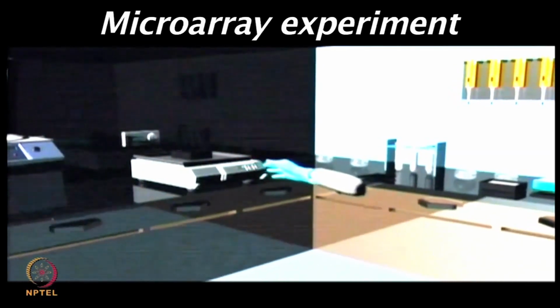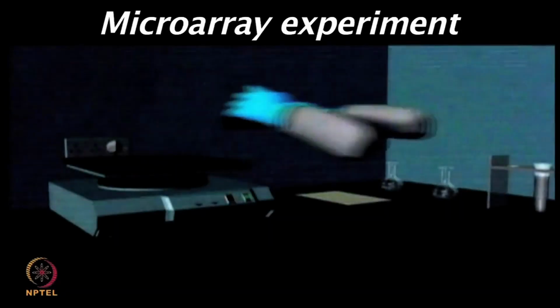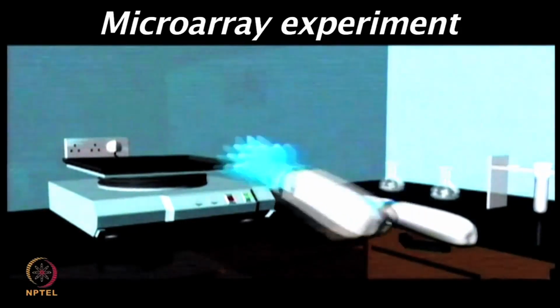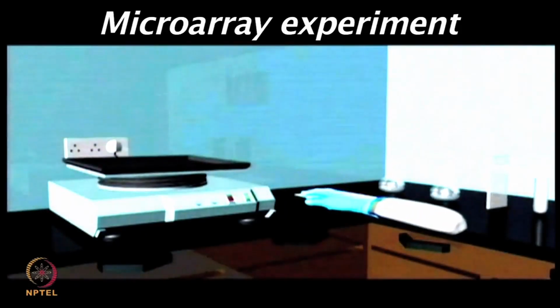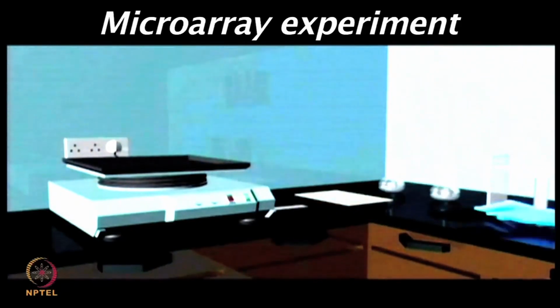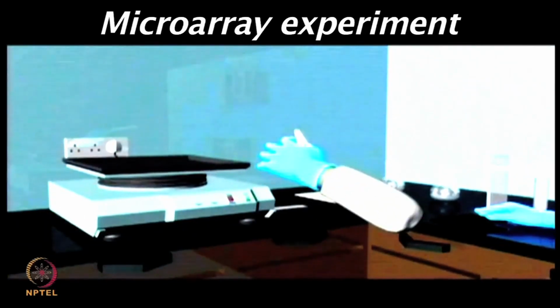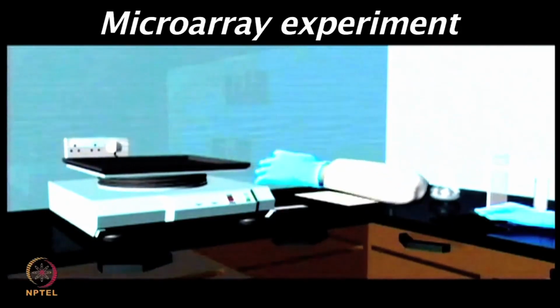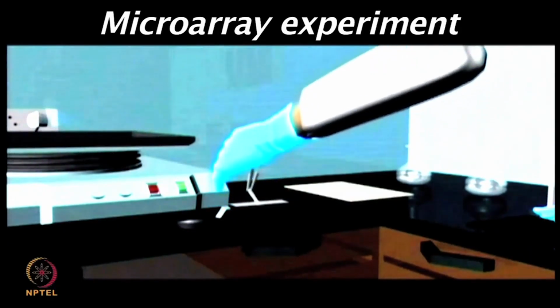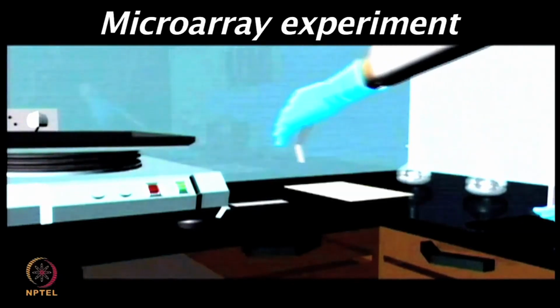Now, when you are adding the secondary antibody, one can also use Cy3 or Cy5 conjugated antibodies, and those could be directly detected. After the secondary antibody, then one needs to wash the arrays again with PBS tween 3 times, similar to what we performed in the last step.